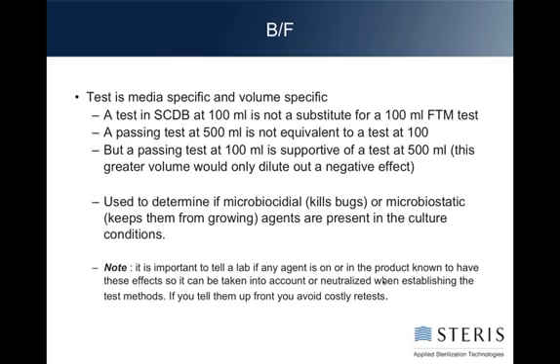You're using this test to determine if microbiocidal or microbiostatic agents, keeping things from growing versus killing them, are present in your product, and that they get extracted into the growth media and inhibit growth of organisms that you want to know if they're present.